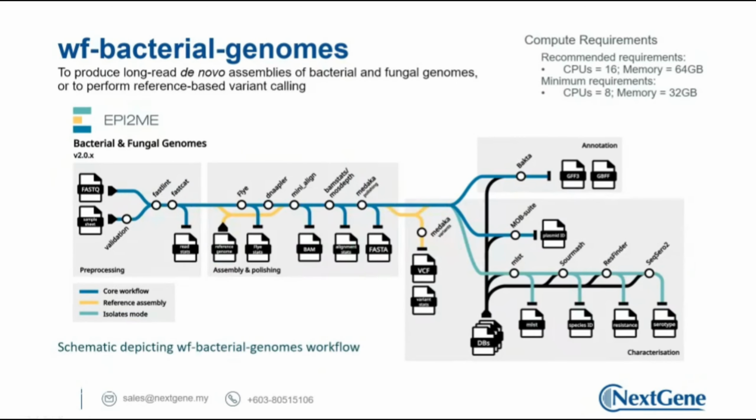The pipelines that will be used include multiple steps, and soon we'll look into this in more detail. I also want to highlight that currently the pipeline's minimum requirements are an 8-core CPU and memory of roughly 32 GB of RAM. This has been increased a little bit. The older versions of these workflows could cater only to bacteria.